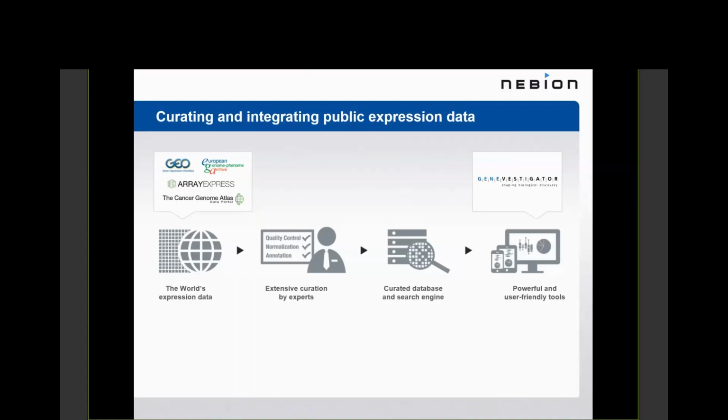And I would like to pose two main questions that we would like to answer today in this Genevestigator Qlucore combined demonstration. The first is, can we verify whether the signature that Anne has created is really specific for the disease NASH? And secondly, can we validate disease biomarkers? We will answer the first question by choosing a dataset that includes other published studies, which we can use to compare to our results and to look for other similar findings for verification.